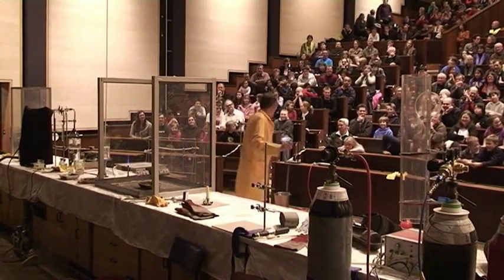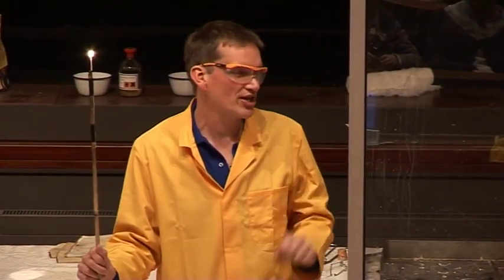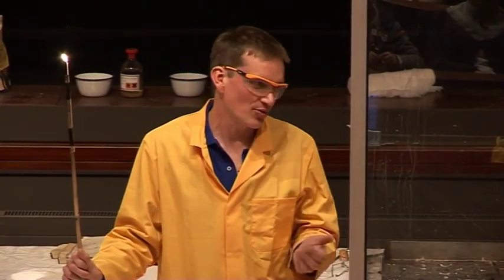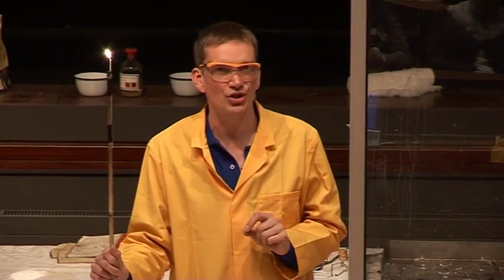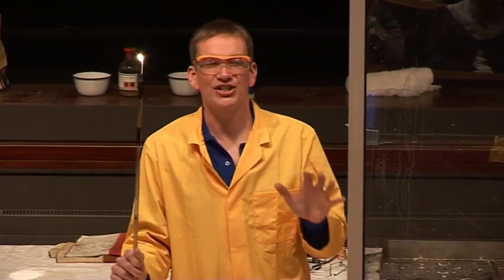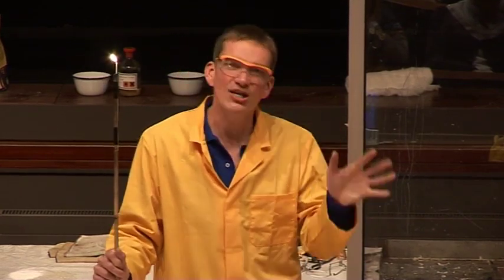So that was certainly a bit louder, but we can do better if we mix the gases in just the right ratio. Now, what's the formula for water? H2O. And this means we have 2 atoms of hydrogen combined with 1 atom of oxygen in every water molecule. So if we wanted the gases to react in just the right proportions, we need to have twice as much hydrogen as oxygen.